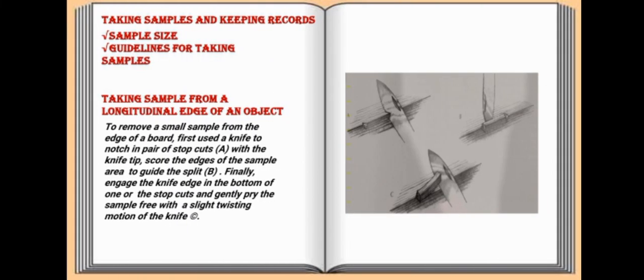The third is taking samples and keeping records. This one is the sample size. In histology or microscopic examination, it refers to the amount of tissue or material used for sectioning and preparing slides for analysis.